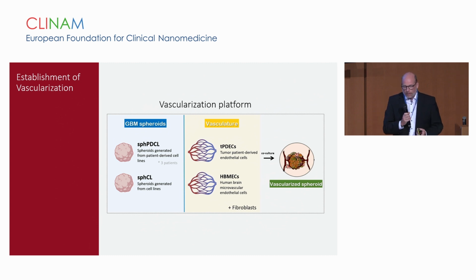How we want to do it is not that easy, and we do not have that many patient-derived tumor organoids, so we stepped back and used some cell lines to create these spheres in order to explore which particular technique might be the most successful one to combine the organoids and the vascular tissue. This is mentioned here, but at the end of the day, we would like to find a method to combine the vascularization and the tumor organoid I showed before.